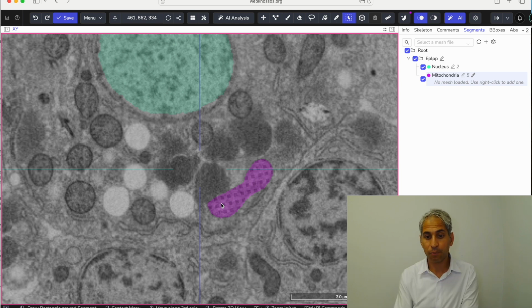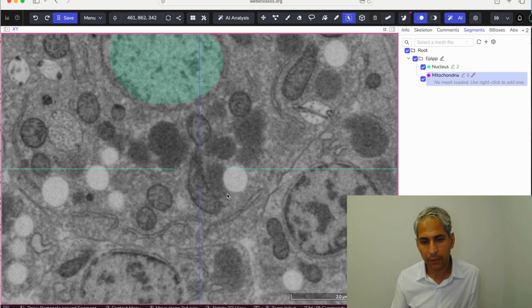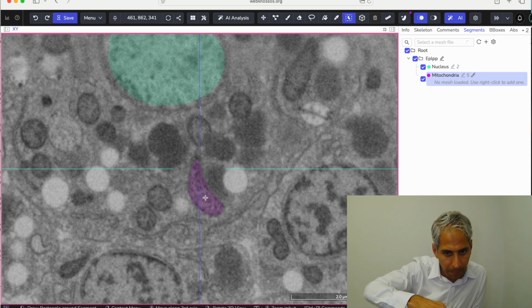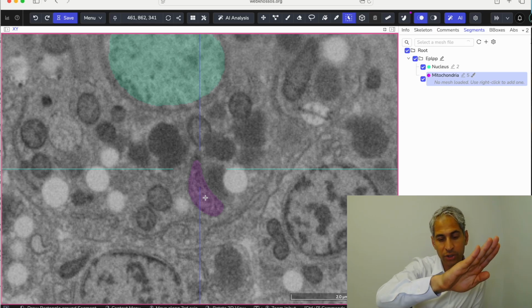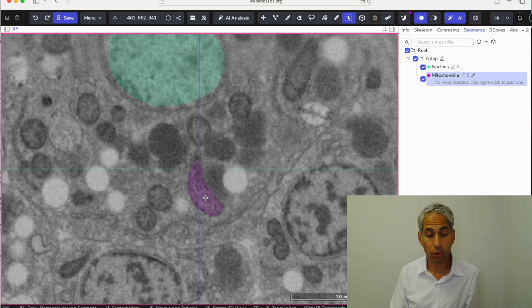It's going to cause a lot of problems, so I'm not going to interpolate here. But if I go a little bit, let me just do this one because I forgot it. And then if I go here, here's the extension of the mitochondria. It's snaking in two directions, down and towards the nucleus. But I can trace its origin back to what I started to segment.